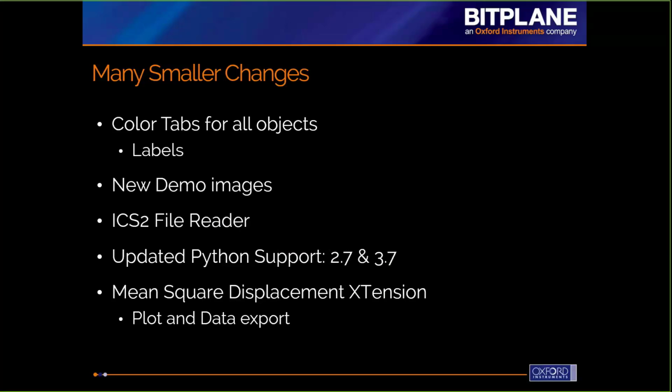We've also made some changes to how labels work. I'm not going over labels here. I should have made time in the slide for that. We've changed how they work a little bit on the color tab. It's going to be much more intuitive for current users as well as new users to jump into using labels. I would highly recommend that you play around with labels, and if you want to learn more, there are some tutorials online for that. You can get to those by going to our homepage and looking for the video tutorials link, and that's at the top of the page. And you can also talk to your sales and support representatives to help you with those as well.